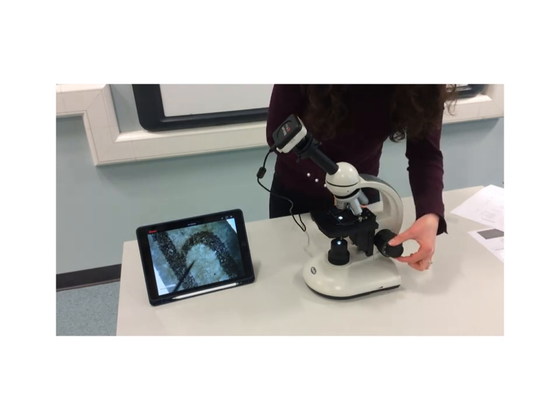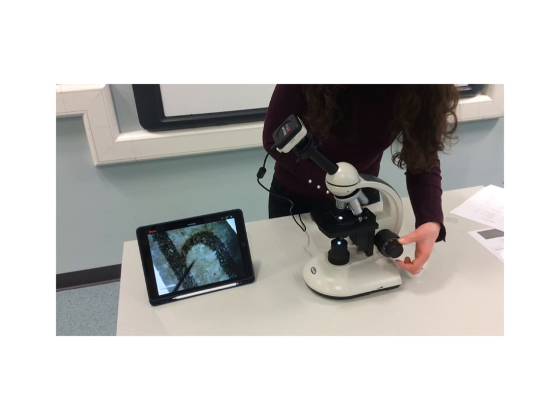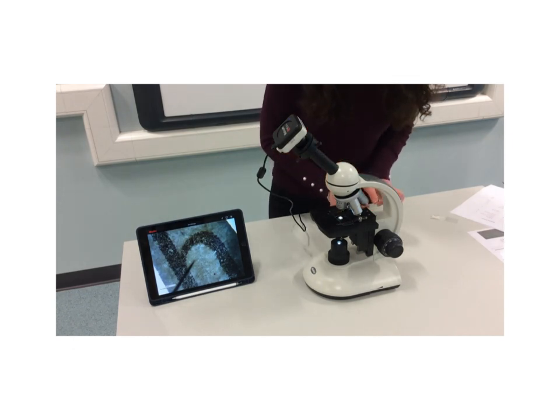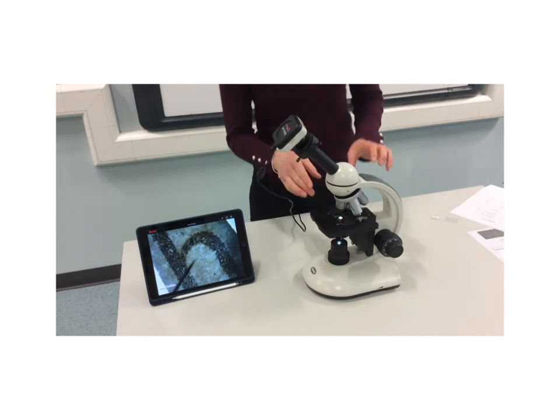And what I can do on either side is use the fine focusing knob. It might be hard for you to see at this stage, but that will bring it into finer focus. You can see it's getting a wee bit more blurry now. And there it's getting a bit more focused. I'm turning it the other way. So the coarse focusing knob we normally use to get the image into view in the first place, and the fine focusing knob then to get it into finer detail. Okay, so hopefully you can see that that's the letter H.